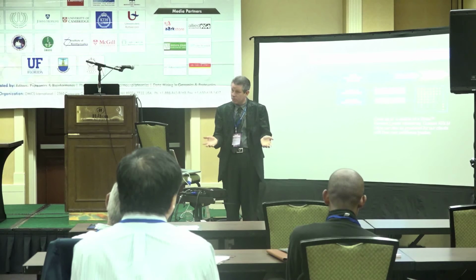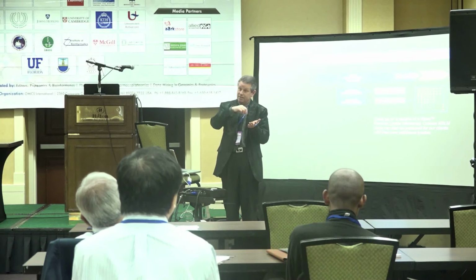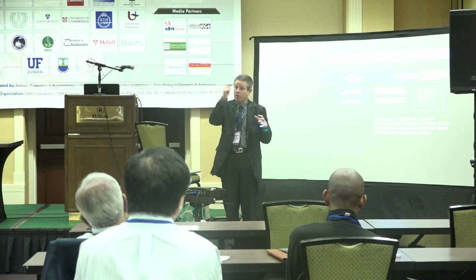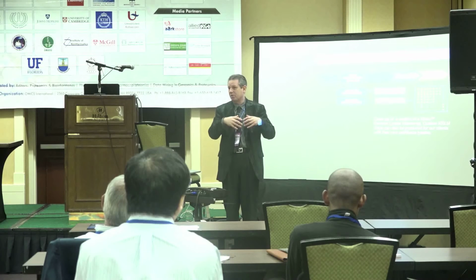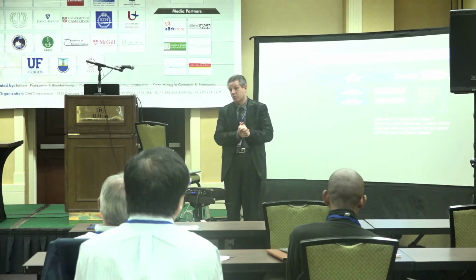If you have a large number of individual samples, then you spot, rather than antibodies in the microarray, the lysates from the samples separately on the microarray, and then you probe that field of lysates with one of the biomarker antibodies. And then you see, is it biologically validated? It's not something that was just in a few samples, but is a more general trend. And that's how you can start to define those kinds of biomarkers we really want.